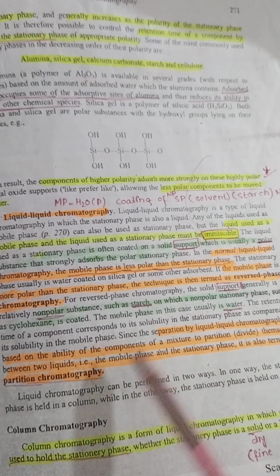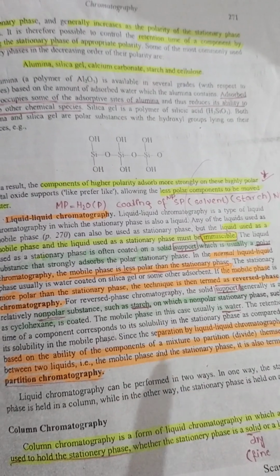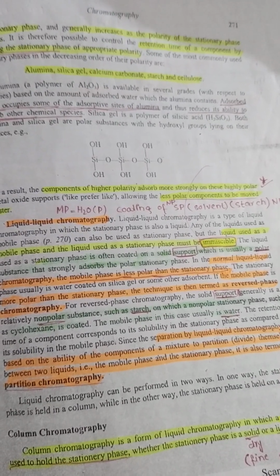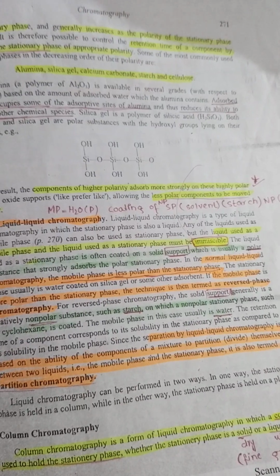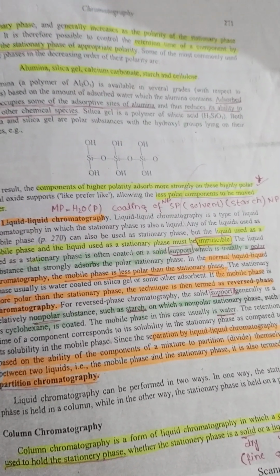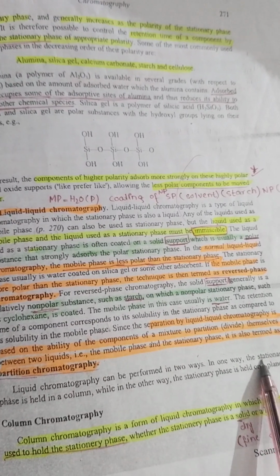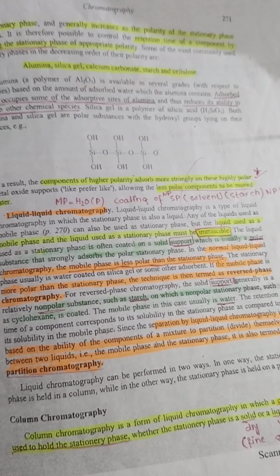Next, its principle is partition chromatography, and we also call liquid chromatography partition chromatography. Components are separated on the basis of their concentration in the mobile phase or stationary phase. In liquid chromatography, two types are used: first is plane chromatography and the second is column chromatography. We will discuss them in the next section, inshallah.